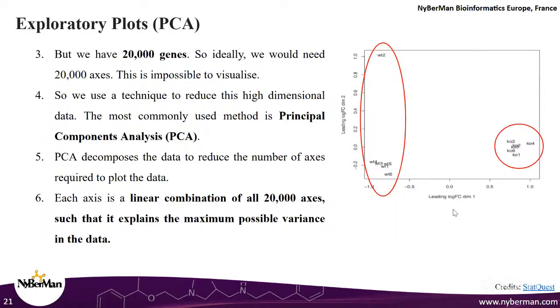Okay, so PC1 will, for example, have 39% of the information. PC2 will have 37% of the information. So if you plot both of them together in this 2-dimensional plot, you're effectively explaining 37 plus 39, that would be 76% of your data. Now, if you add PC3, which might have say 18% information, that is now 76 plus 18, that would be 94%. So using only 3 axes, you're able to explain 94% of the information in your data.